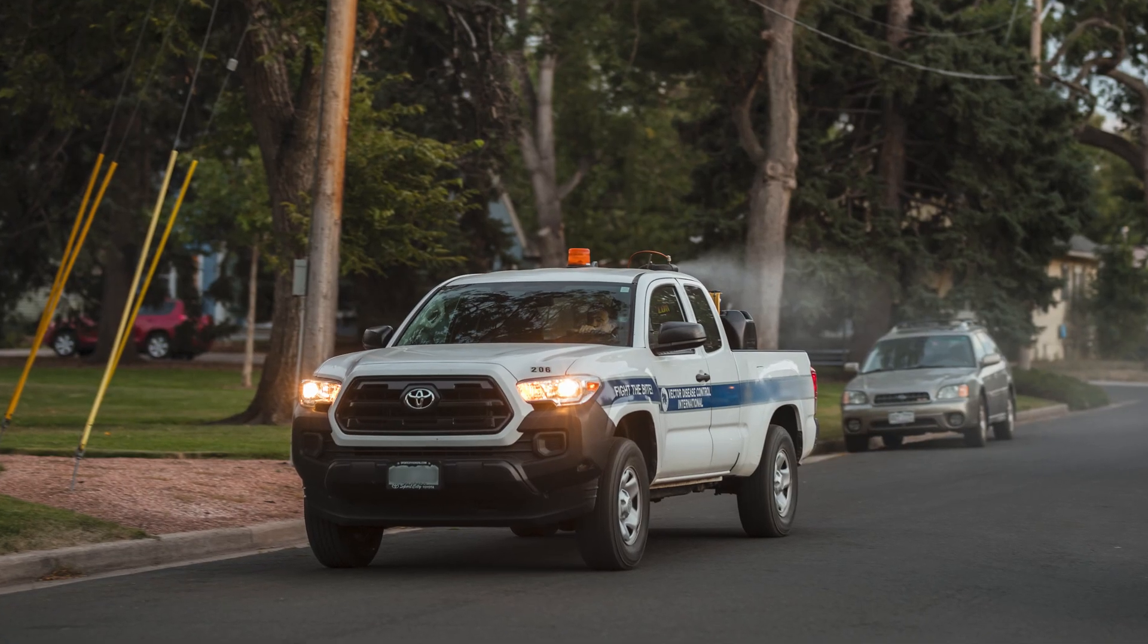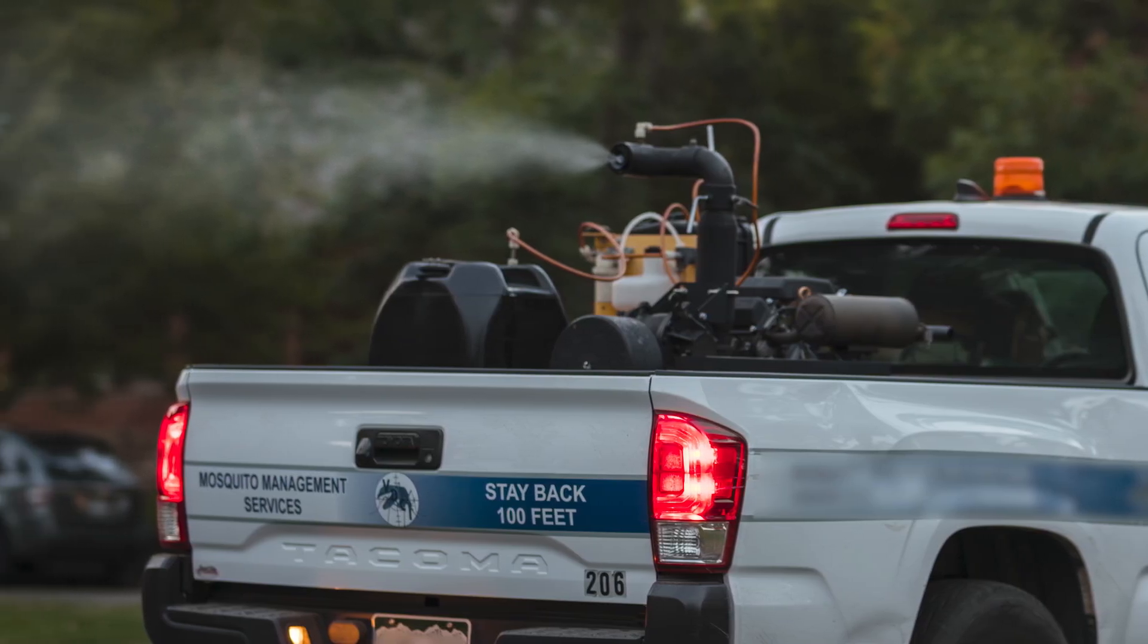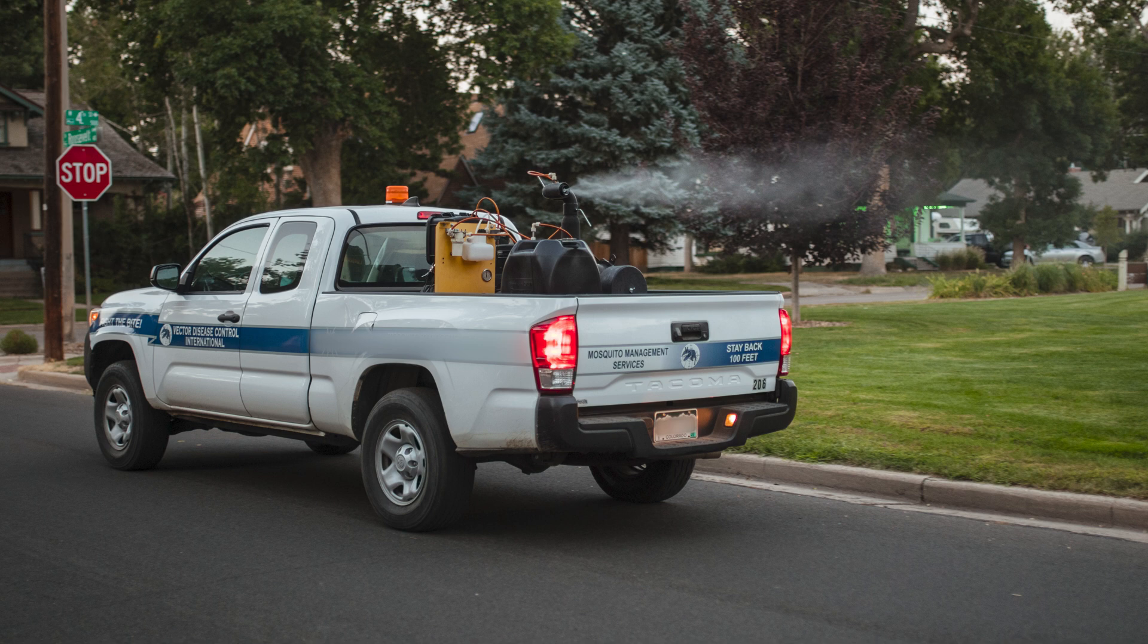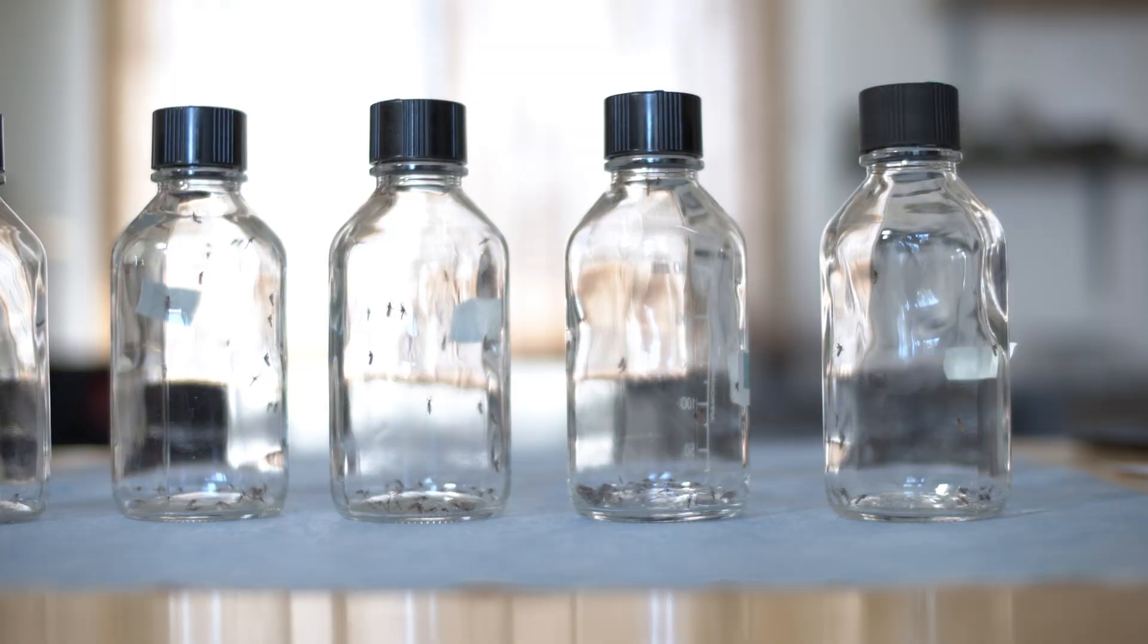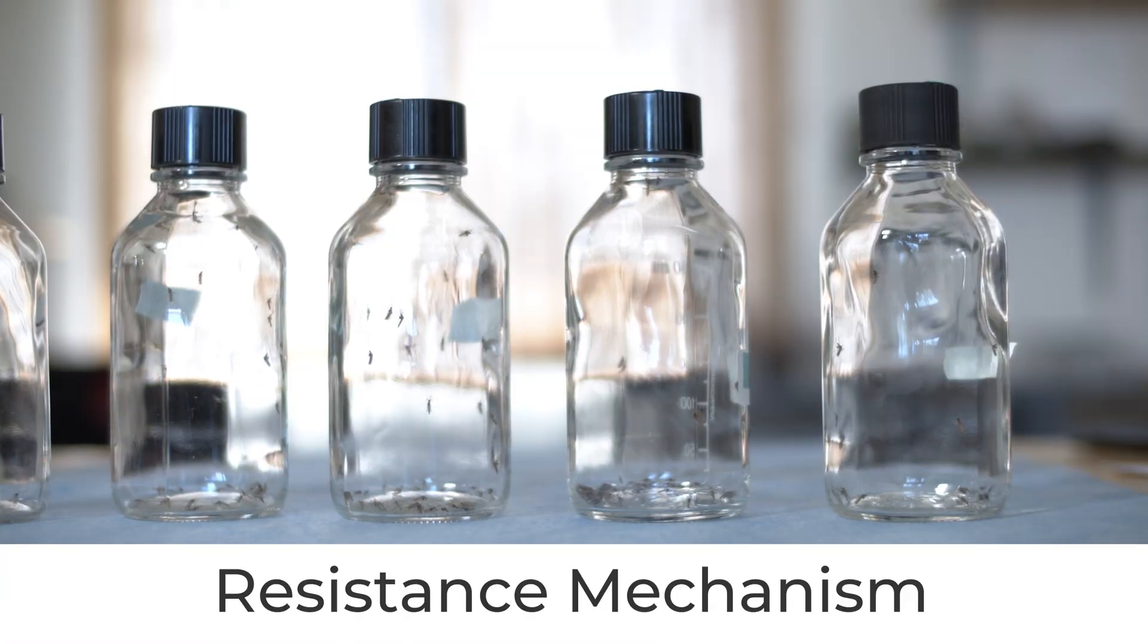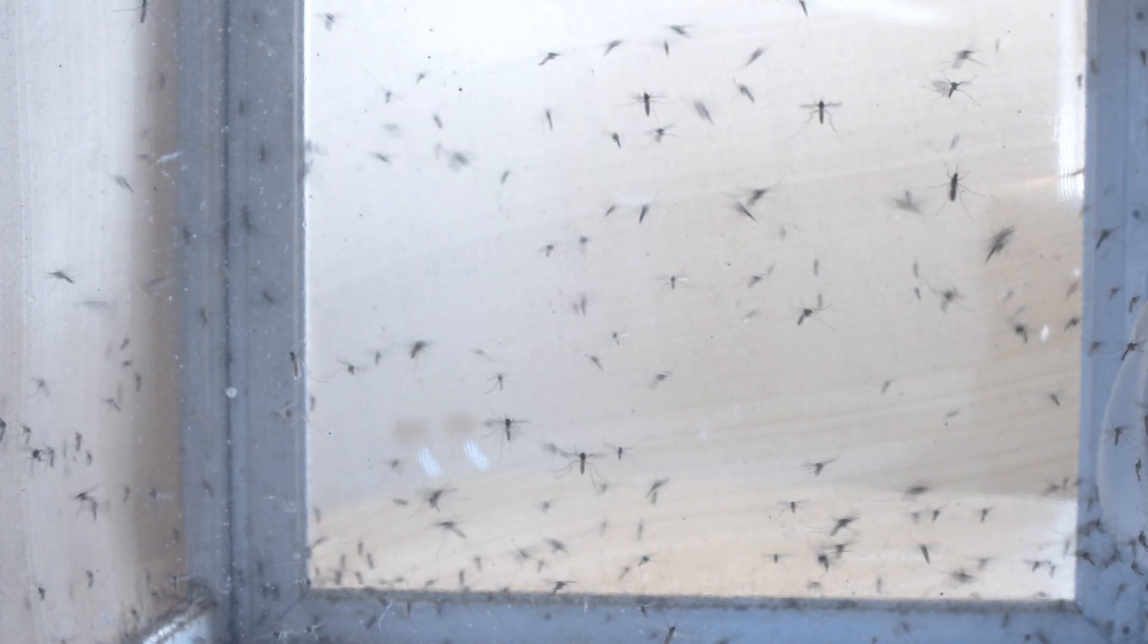The use of insecticides to kill mosquitoes is one part of an integrated mosquito management program. Over time, and with repeated use, insecticide resistance can occur in mosquito populations. Mosquitoes develop resistance to insecticides in different ways, which are referred to as a resistance mechanism. CDC's Bottle Bioassays can detect the strength of that mechanism.